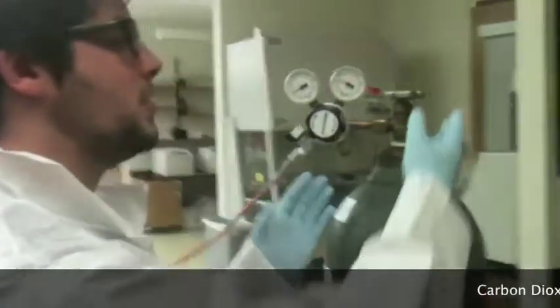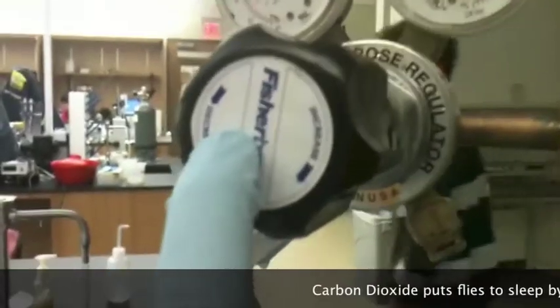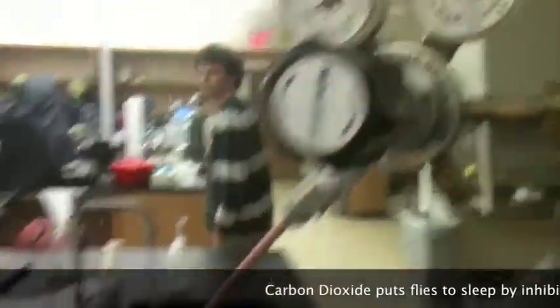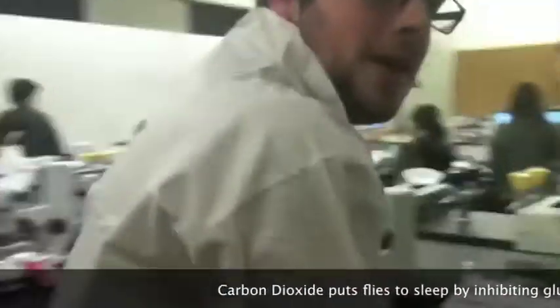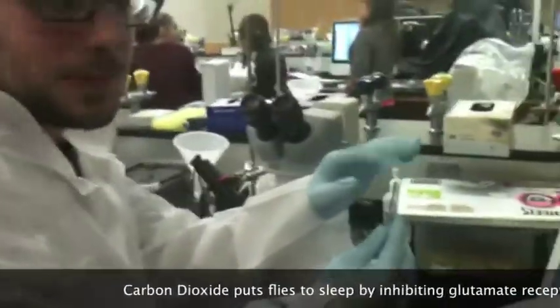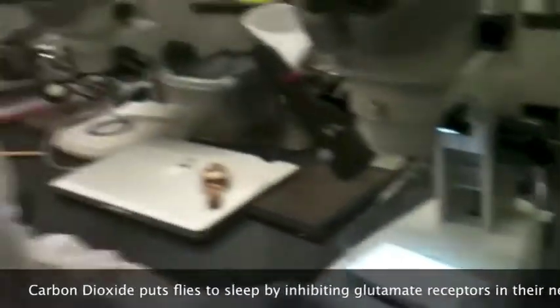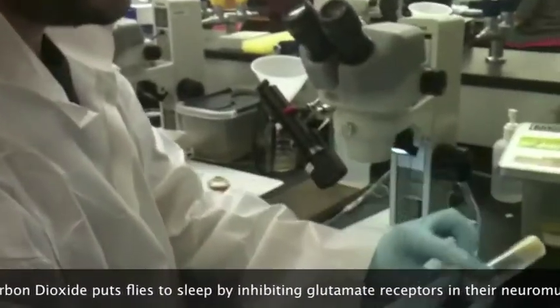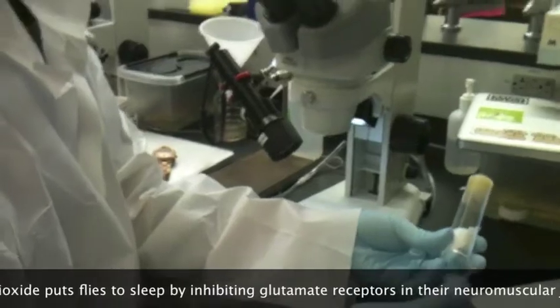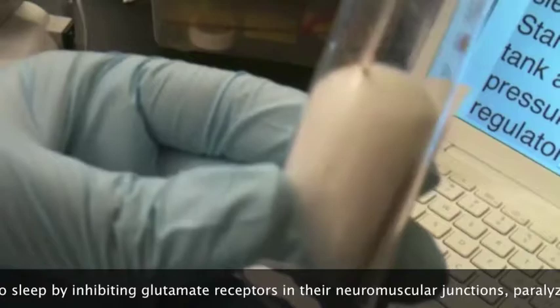Putting flies to sleep is fairly simple. You start by turning on the gas by turning this knob, then adjusting the pressure with this regulator. As you can see, it says increase and decrease to change the pressure. Once you have the pressure you want and the gas is coming out of this needle, you can test it on your hand or any part of your exposed skin. Take the needle and slide it into the cotton, making sure you're holding it upside down.